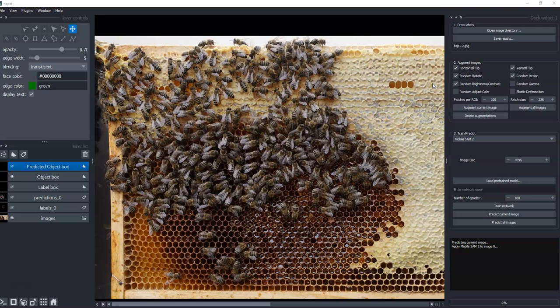All this functionality also relies on the proper Python packages being installed in the back. So I don't want to make any claims about this plugin that aren't true. It's just a very experimental widget for trying different deep learning methods, but not something that is polished or tested at all yet. Okay, so that being said, one of the goals here eventually, someday, is to be able to quickly evaluate the different deep learning approaches in the same plugin. And so you have this menu here, and you can choose the popular options: Stardist, UNet, Cellpose, MobileSam.